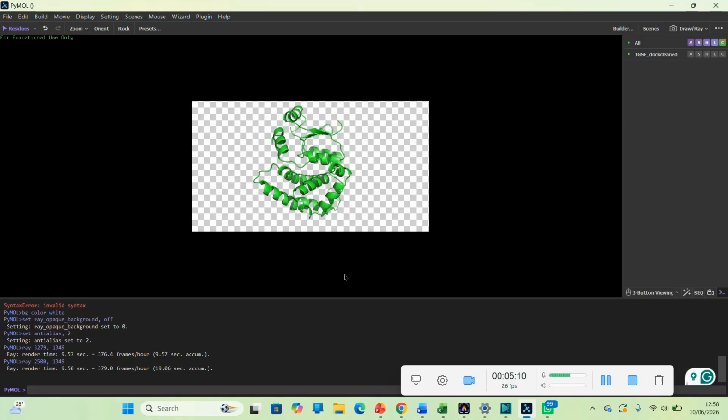So in other cases, you could even use a very high resolution like I did earlier, and then trim off the excess using a picture editing software, because by then the quality is already established.